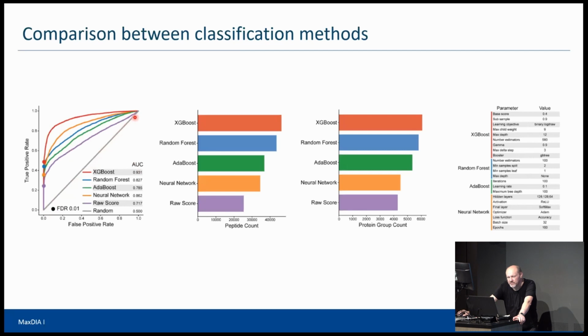If you have something that is worse than random, then you would actually have a line that is convex like this here, which can actually happen. Sometimes predictions are worse than random predictions. That's always funny, but it happens. It's actually quite useful because you can just use this as an anti-predictor. Whatever the predictor says, you say the opposite, and then you have a good predictor again, right?